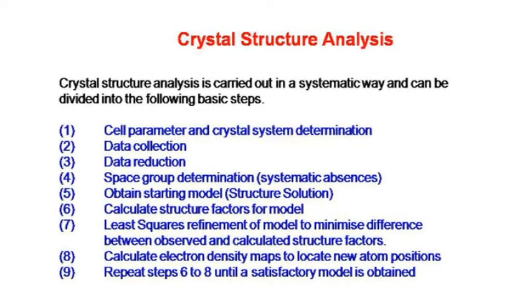So, the interesting bit: most of you will never sit down and actually collect a single crystal data set, but some of you might, if you ever get the chance. It's work to do. We can divide up the crystal structure analysis into a number of different steps.